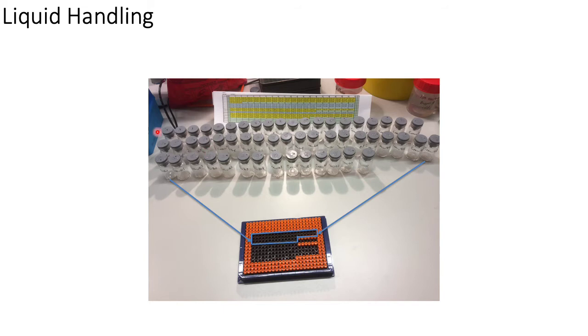We need to put them in a special order, and this needs to be programmed into the robot to be able to add all these compounds into the plate in a specific way.